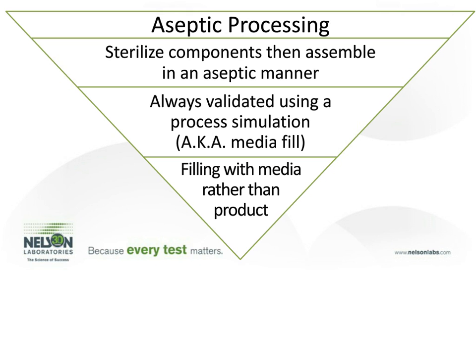In a media fill, the containers that are usually filled with the product are instead filled with growth media. Then once the containers are capped or sealed, they are incubated for a period of time, and then it is determined if there's any growth in any of the containers.